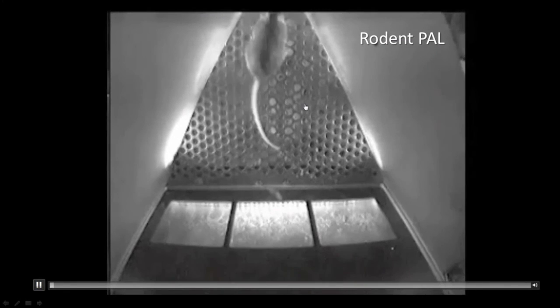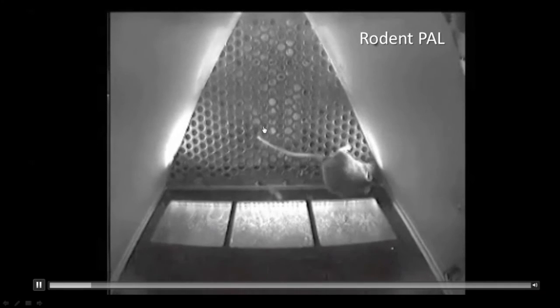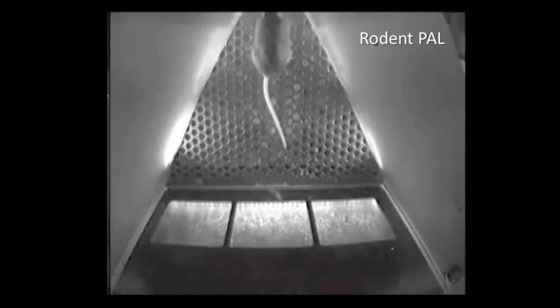And here we see a mouse doing the task. So he initiates the task by going to the rear and then touches the screen, and because he got that correct, it's now taking the reward. Then we go into an inter-trial interval, which is around 20 seconds normally. After that period, the light will light up in the reward area, which is at the rear, and he touches it and another image comes up and goes for another reward. So here you can see a very well-trained mouse.